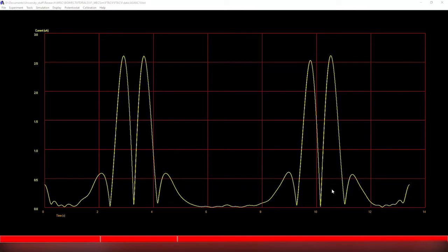You can fit that like so. Now I'm just going to quickly load up 5 triplicate experiments. I recommend at least 3, preferably 5, ideally 10, but it depends a lot on your experiment conditions. If your experiment's really difficult to get, it's going to be quite hard to get 10 triplicates. If you have to do 10 experiments to get one single bit of data, getting 10 of those is going to be quite difficult, so something more like 3 to 5 is probably appropriate there.